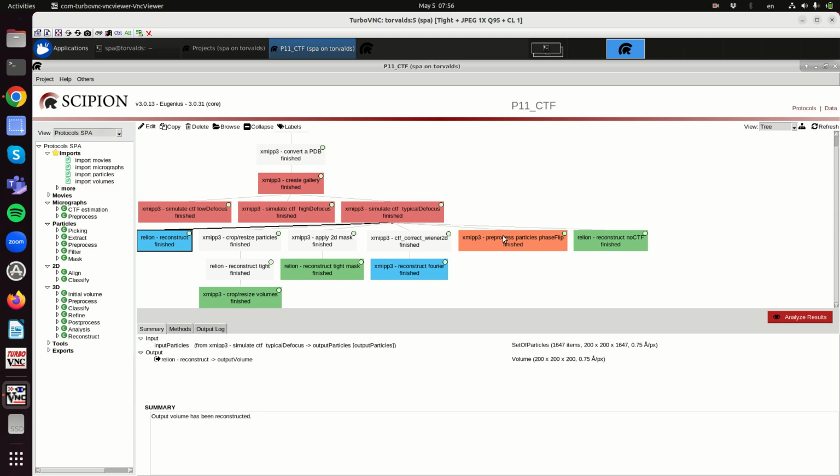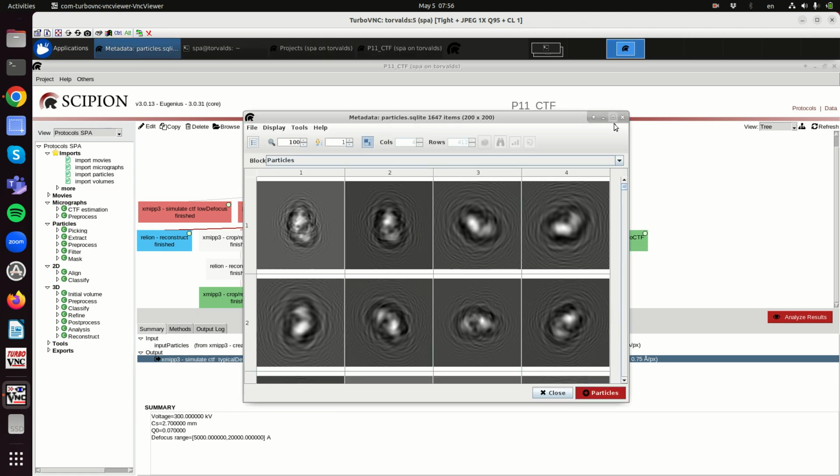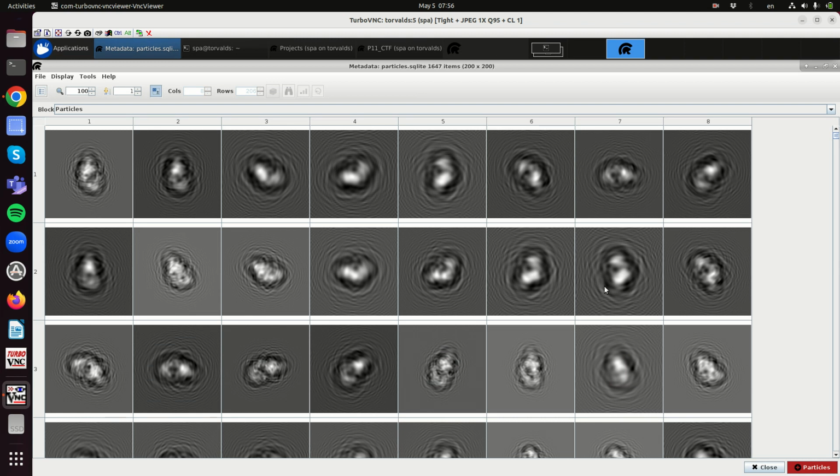all need the information around. If these images have lost the information around, and here we see that some of them are already a little bit too tight, because we see the nearby copies, that means that this copy wanted to spread a little bit more. So the information can be quite spread.